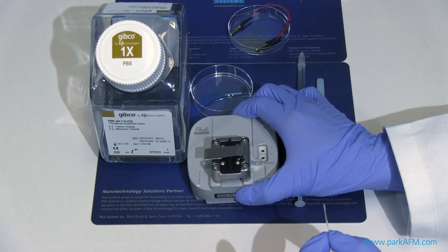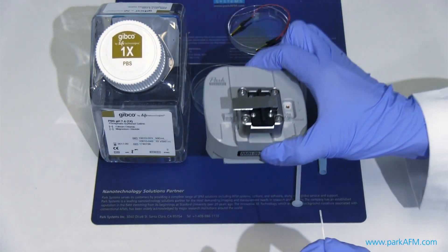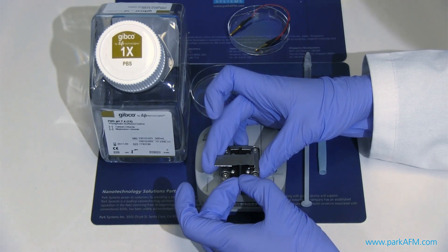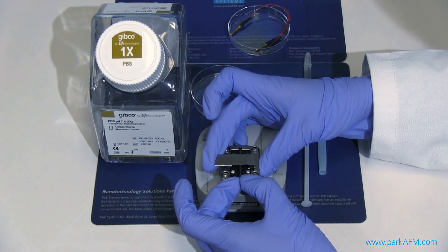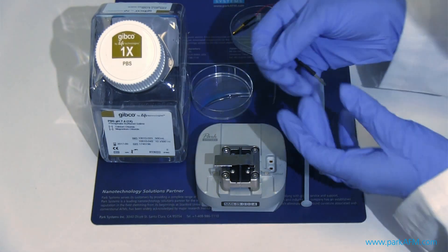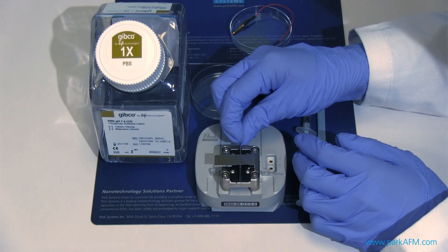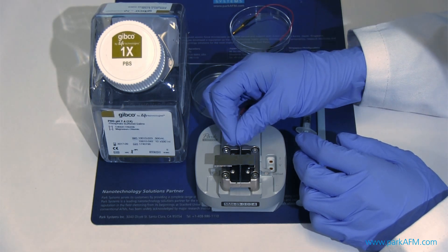Now let's attach the pipette to the SICM head. Lift the spring clip and slide in the pipette first, and then wire the pipette to the head by plugging in the silver silver chloride electrode.